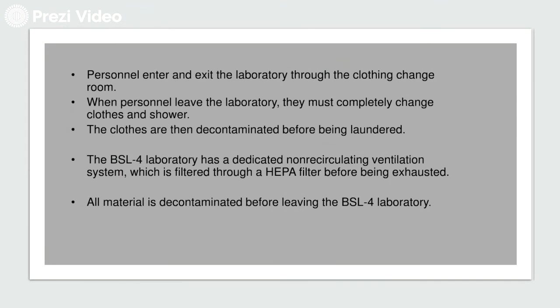So, in the Philippines, anong meron tayo? Hindi ko lang sure kung okay na yung level 4 sa RITM, pero ginagawa siya. Ang meron tayo is up to level 3. Yun ang meron tayo. Ang meron na level 4 na pinakamalapit sa Philippines is nasa Singapore. And you also have China, of course, and Japan, yung mga yon. But in the Philippines, ang meron tayo na gawa na yung level 3. I'm not sure kung gawa na yung level 4. Pero dinidevelop pa rin yung level 4. So, personnel entering and exiting the laboratory go through the clothing change room. So, hindi ka basta-basta makakapasok sa lab. Kailangan mo muna, meron kang anteroom na doon ka muna nagbibihis.